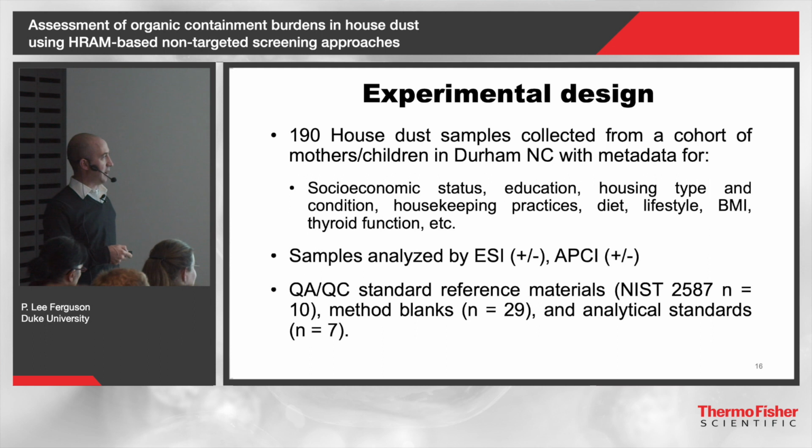We did ESI POSNEG and APCI / APPI POSNEG. We ran every one of these samples 4 times, basically. And then we had a bunch of NIST standard reference materials and blanks, et cetera. So it's a huge data set that we ran through here.